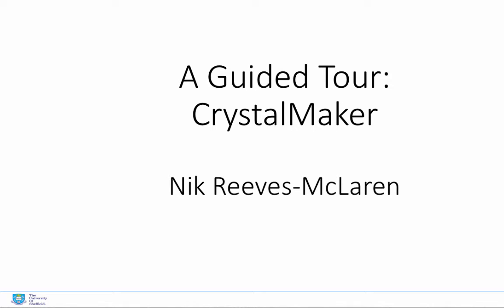In this short video, I'm going to give you an overview of the CrystalMaker software package, which is available for both Windows or Mac OS X. CrystalMaker is a modeling program and crystal structure visualization aid, which is quick and easy to use and lets you build any molecular or crystal structure. We can then output those structures as either graphics files or video files for use in reports or presentations and so on.